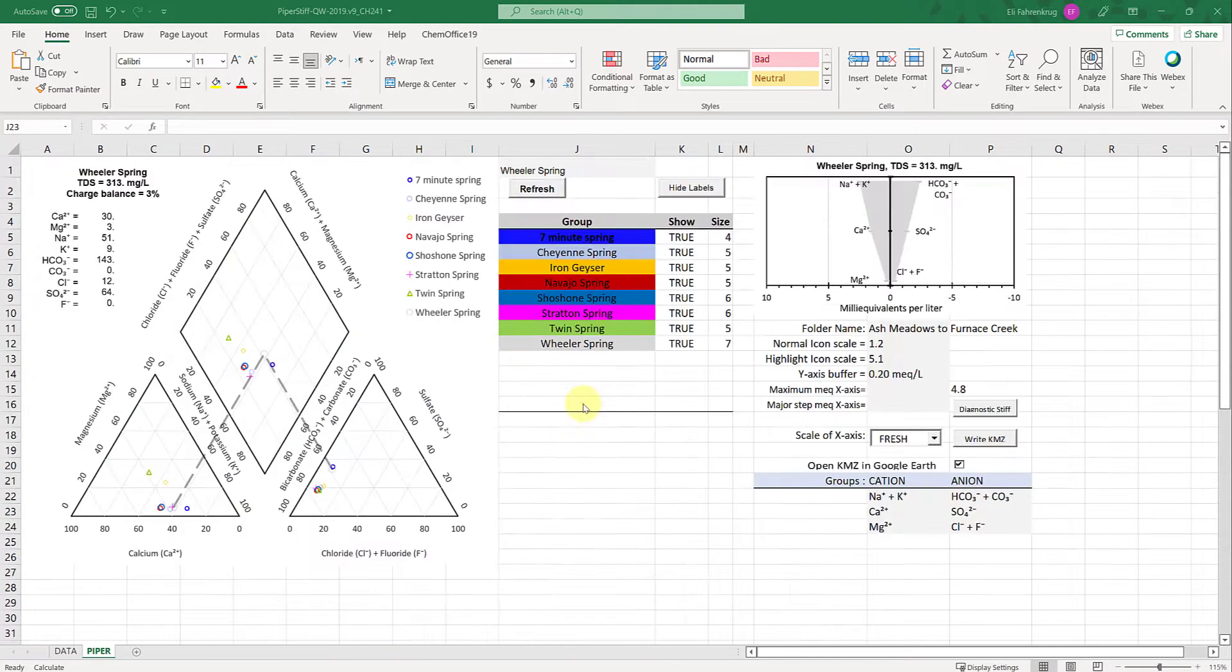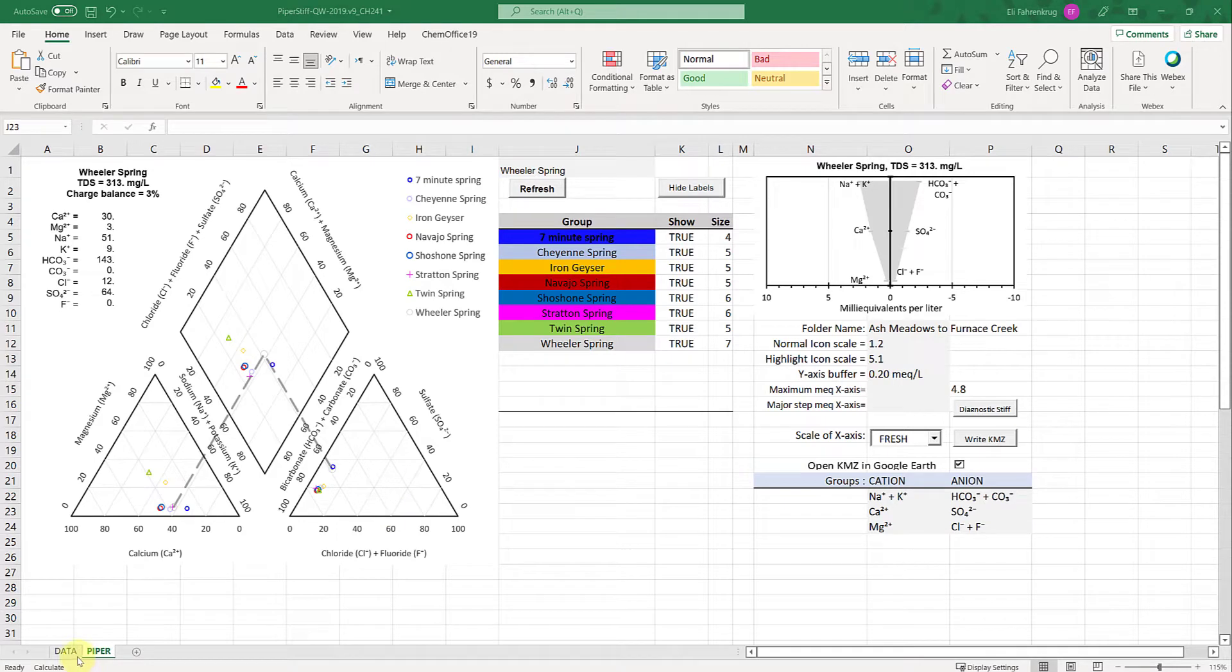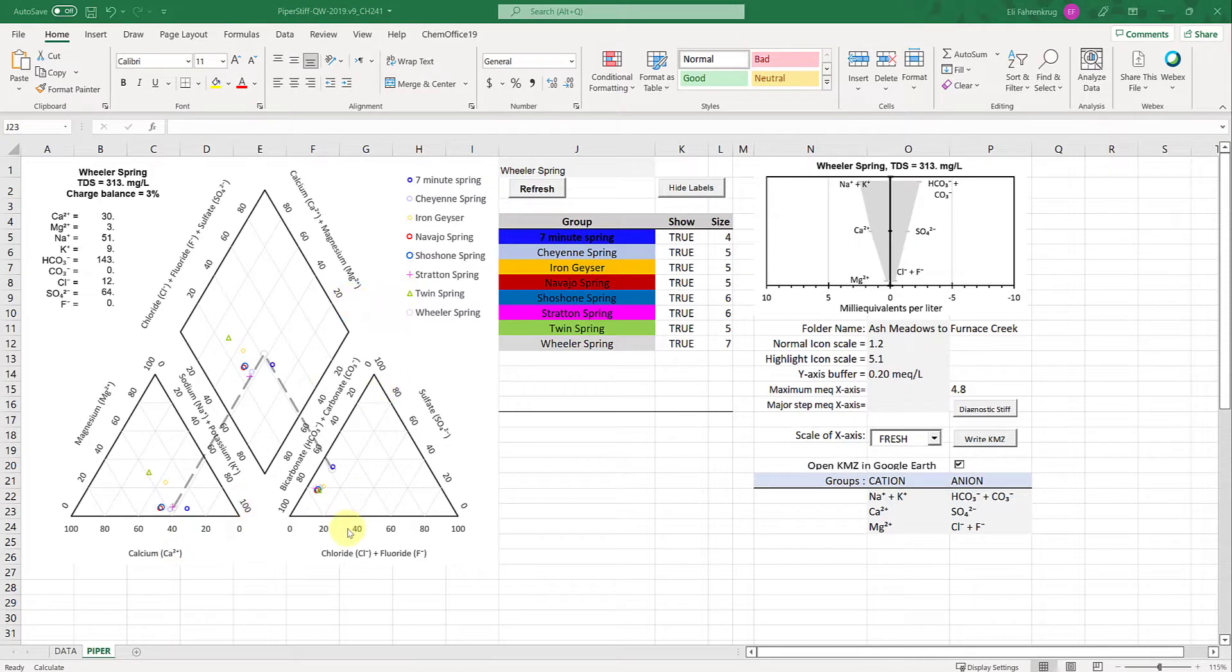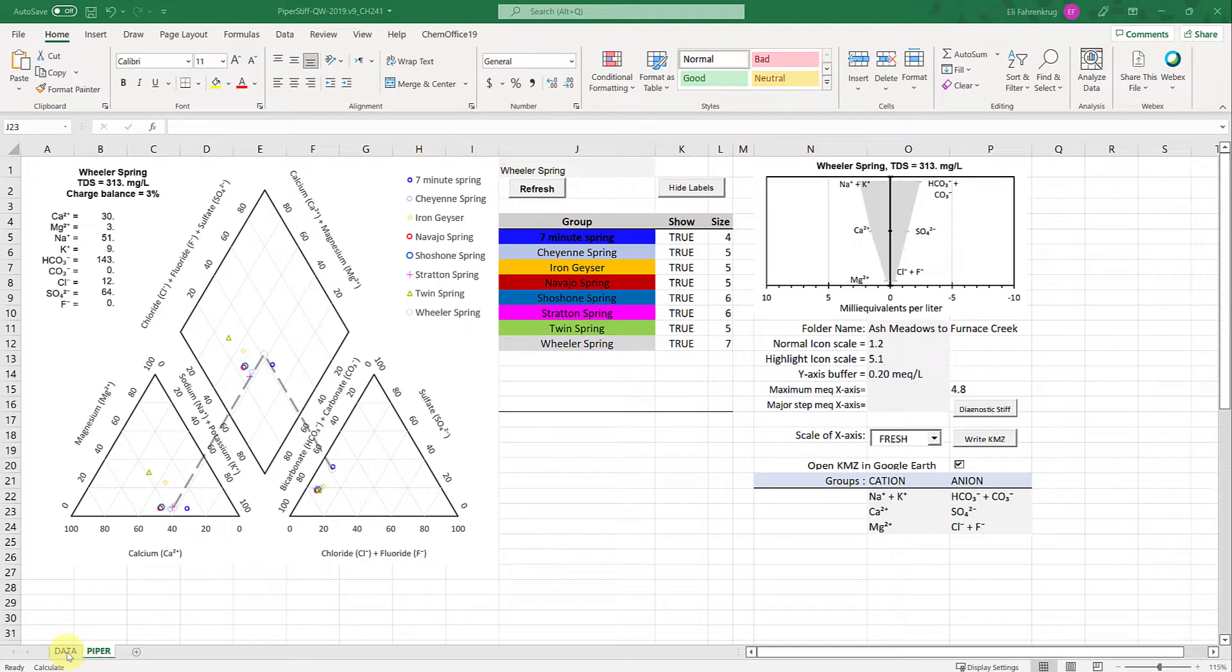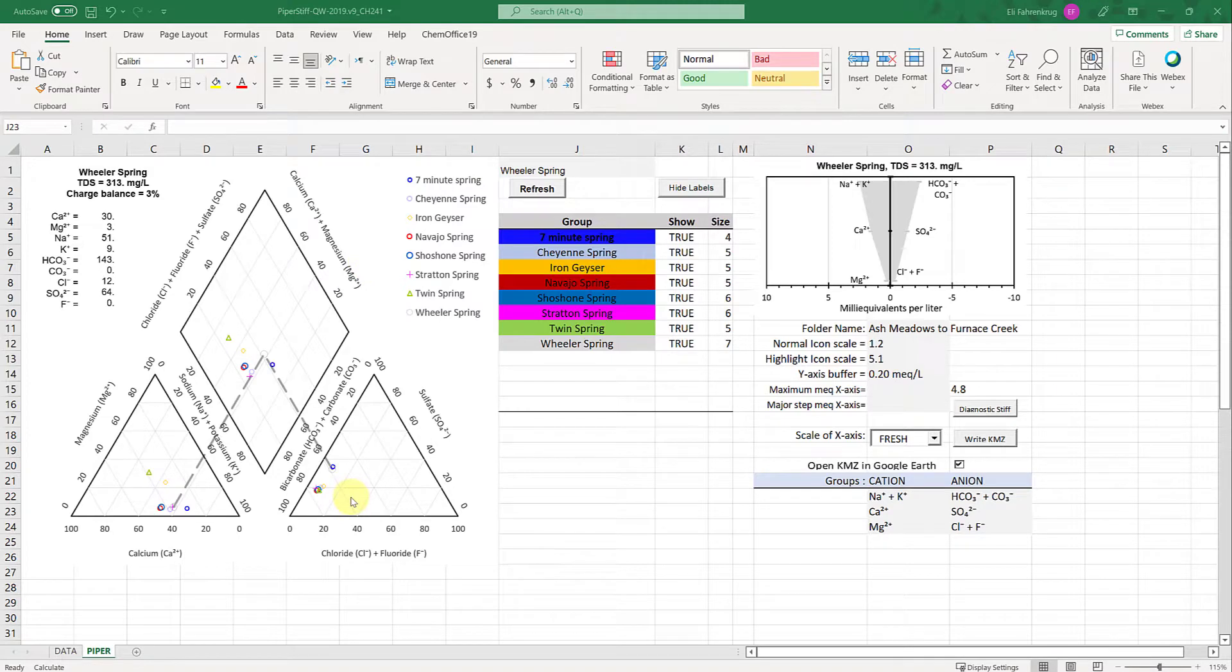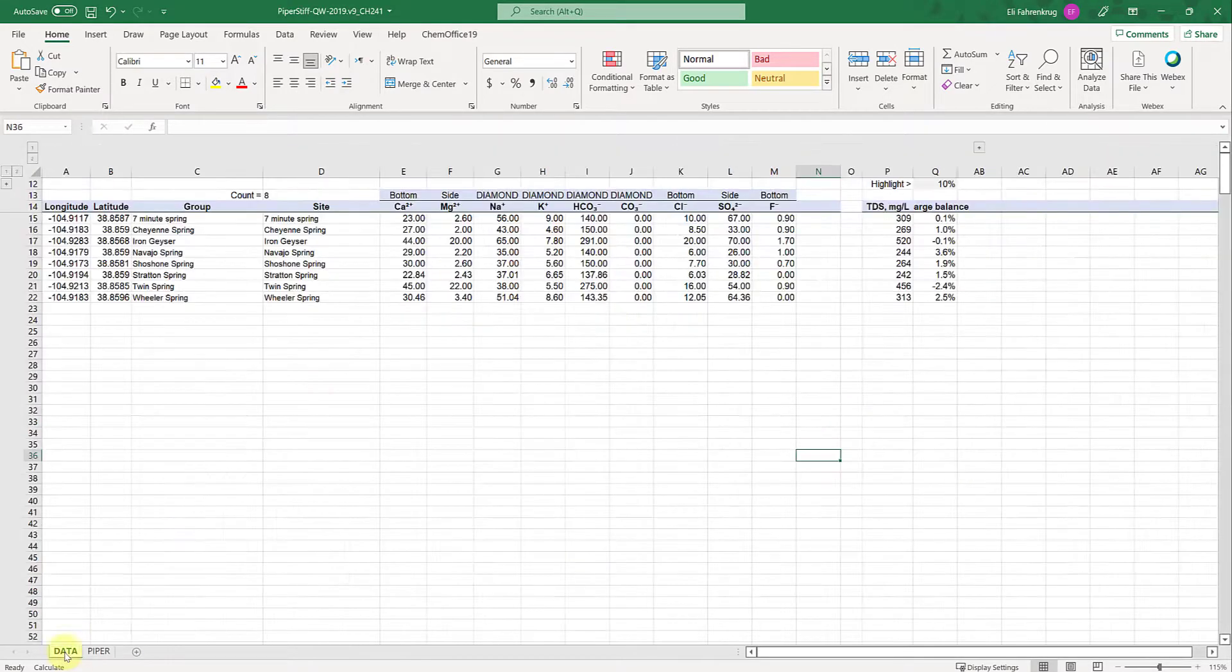This is the interface. Notice down here we have two tabs: the Piper tab and the data tab where the data input goes. All of this interface will generate on its own. I'll show you what the data looks like first.